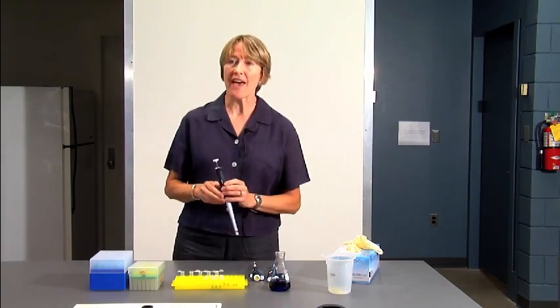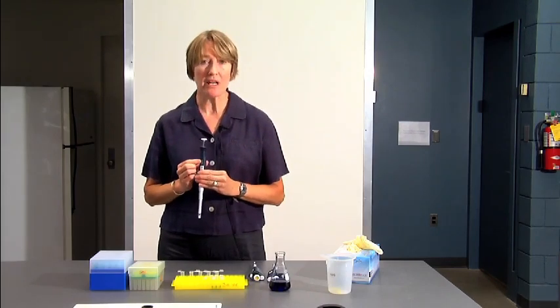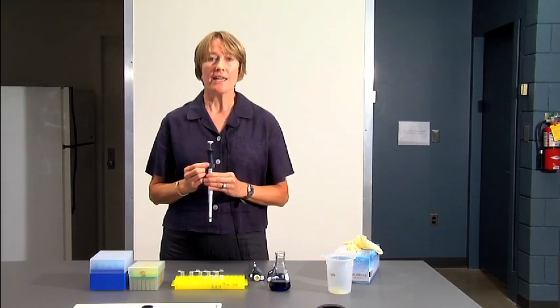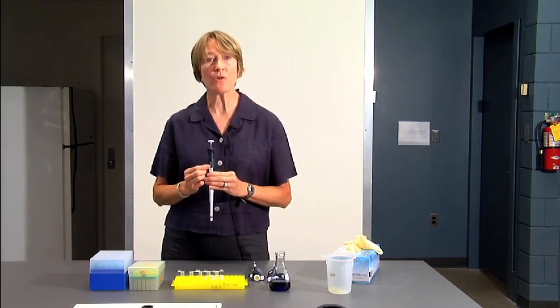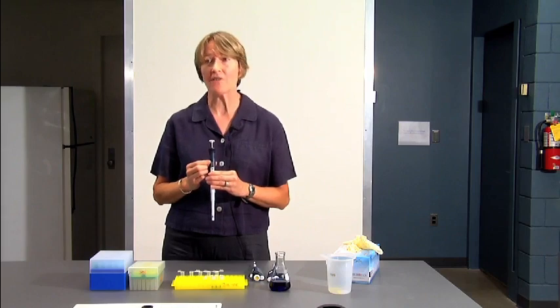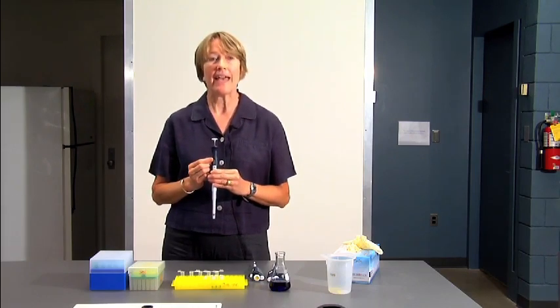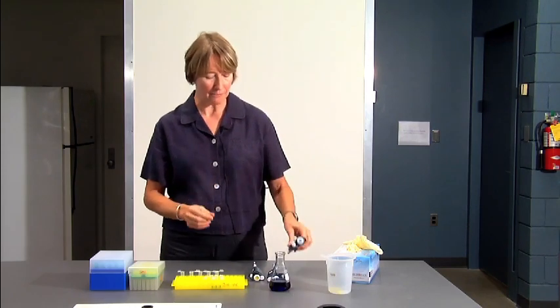Now let's look at the P1000. The P1000 also has 3 numbers, but notice that the top number is in red. So that's an alert signal. The top number is not 100s, it's thousands. So 100 is not 100 microliters, it's 1,000 microliters. If you wanted 500 microliters, that would be 050 on the P1000. So remember, the red number is thousands, and you have to make sure that you know how to set the pipette when you are setting your volume.